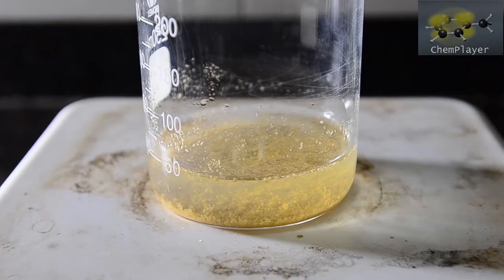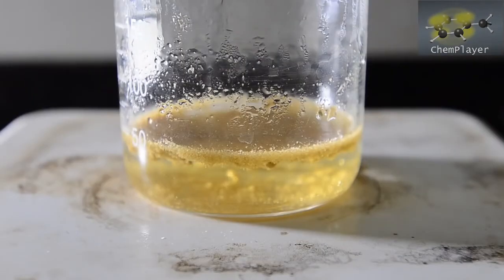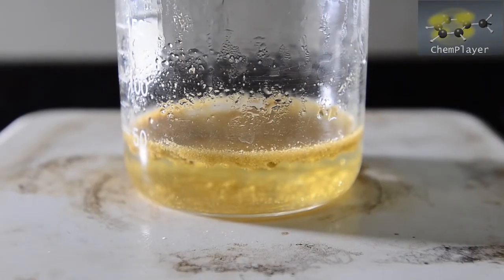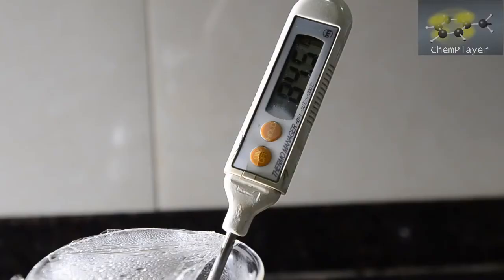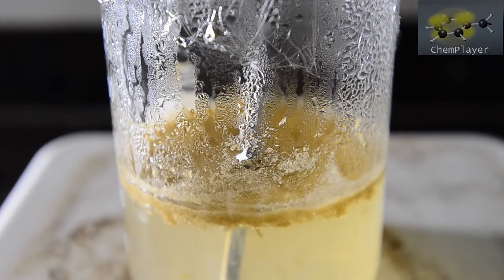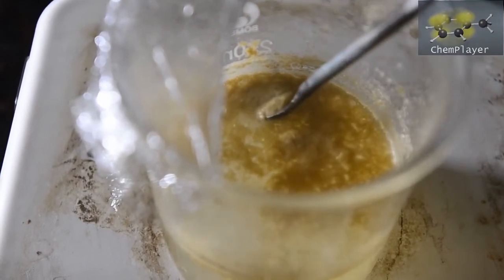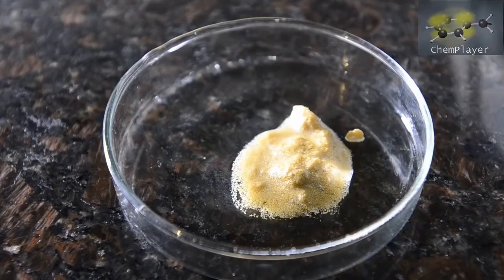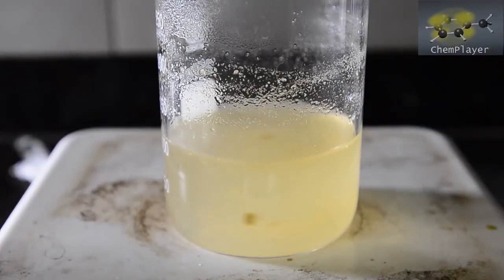Now we're going to heat and see if we can get this to dissolve. We covered the top of the beaker with plastic wrap in order to insulate a little bit. Well, it's pretty hot and there's a lot of solid undissolved, so we're going to add some more water. Getting hot again. And still we've got some solid undissolved, so we add a bit more water to make up to about 100 ml in volume. It looks like there's some fluffy brown material which just won't dissolve, so we decided to use a spatula to remove this from the surface. Okay, most of it has gone now, so we're ready to do the conversion.